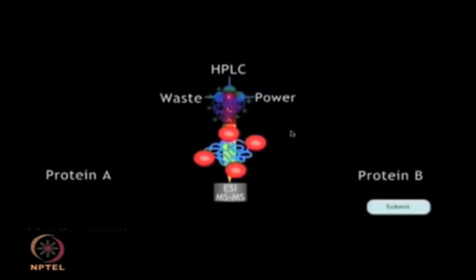So, your answer is correct. You can use the protein properties and separate those in the multidimensional protein identification technology. MUDPIT is a non-gel technique to separate and identify individual components of complex protein and peptide mixtures of a proteome. It has been shown that MUDPIT has potential to be used as a substitute for traditional two-dimensional gel electrophoresis, since it can separate peptides in the 2D liquid chromatography.